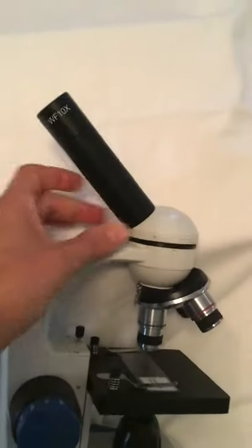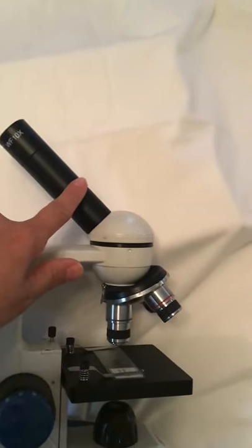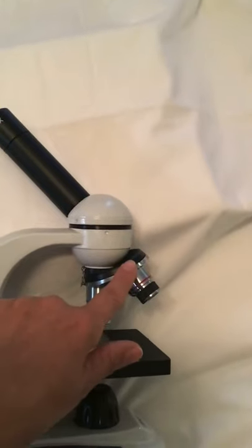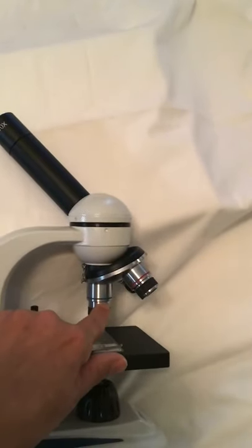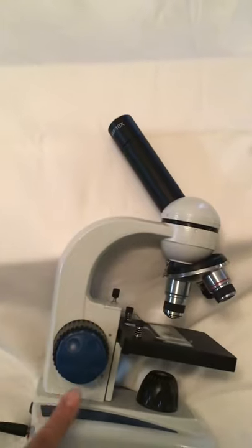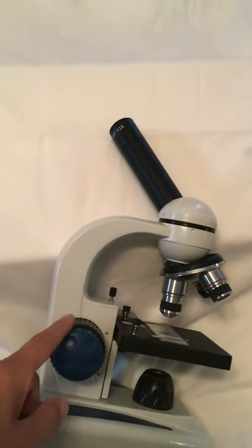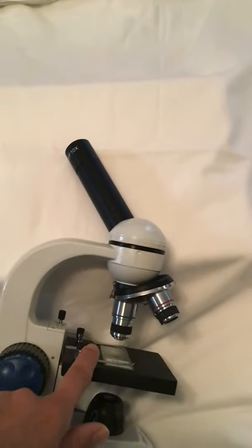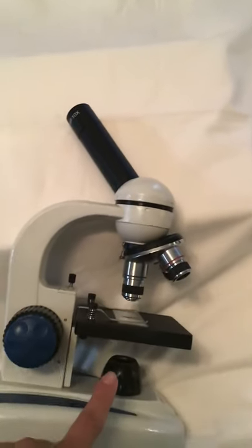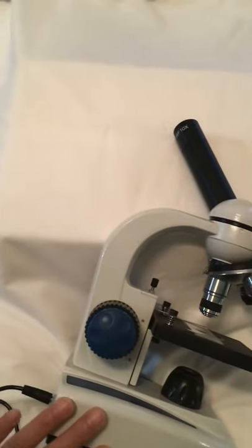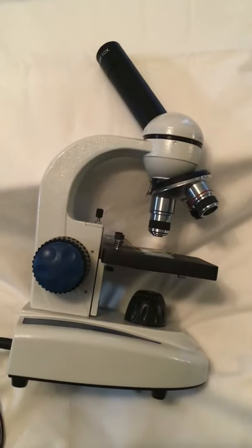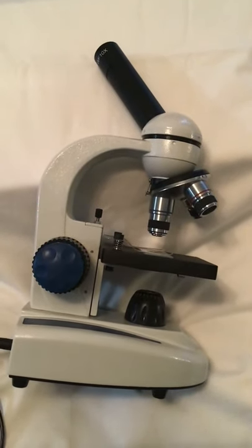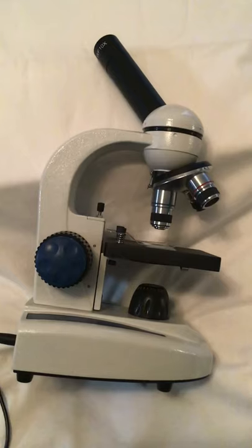So again, to review, we have the eyepiece, body tube, rotating nose piece, objective lenses, arm, fine adjustment, coarse adjustment, stage, stage clips, lamp or light source, base, and then of course you have your power source. And that, class, is the basic compound microscope.